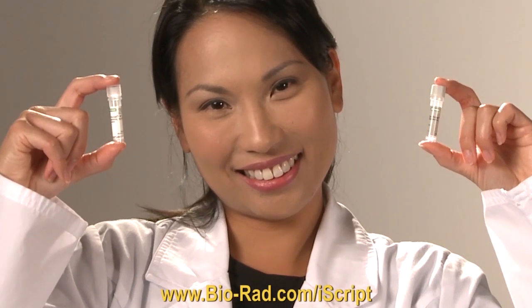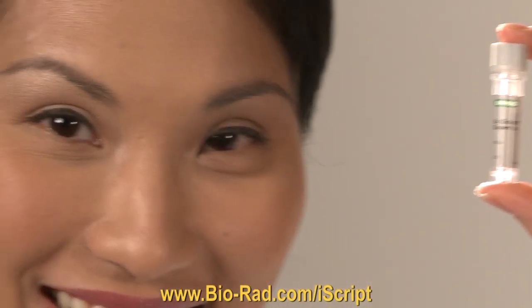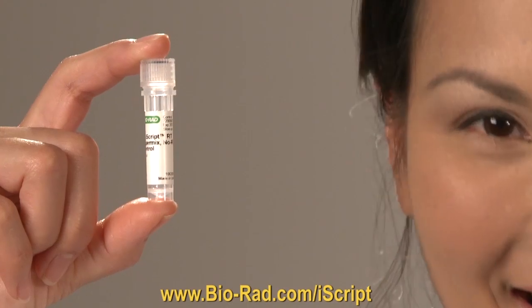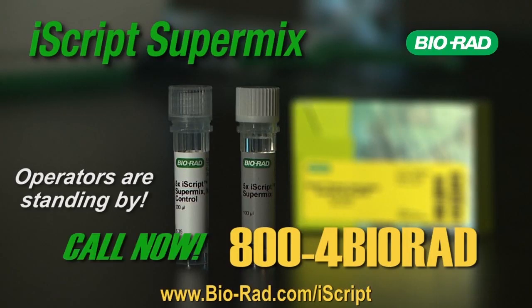But wait, there's more! Order in the next 12 months and we'll also include an additional tube for your no-RT controls at no additional cost. Call now to order iScript SuperMix and start transcribing today!